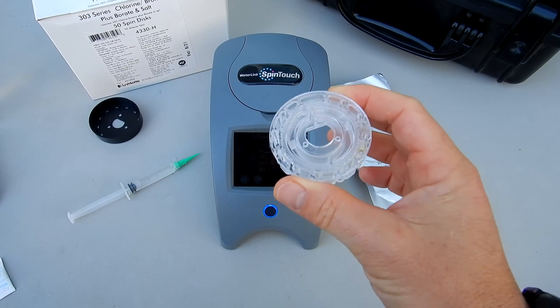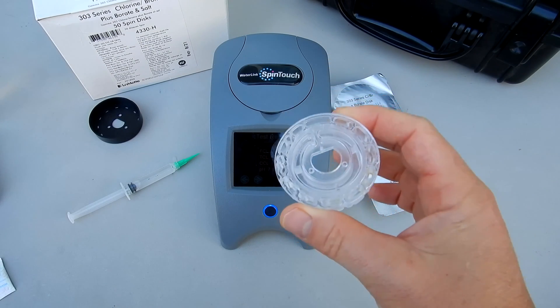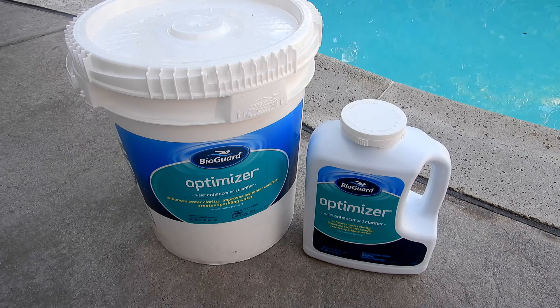This time I'm going to show you the 303 series spin disc. This is a disc that tests for borates along with salt. So if you have a pool that you're using borate in, this is a great disc series to pick up and use with your spin touch.